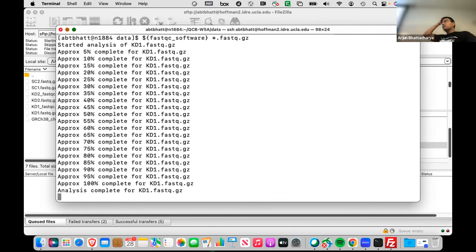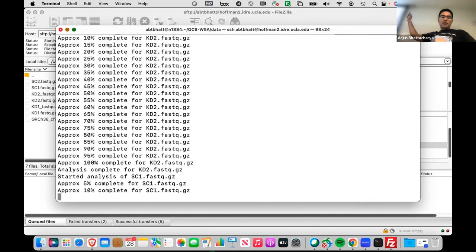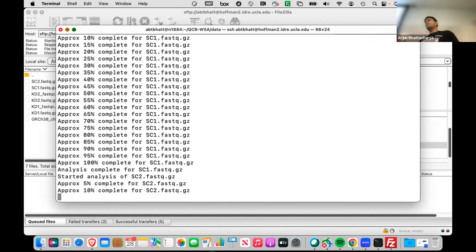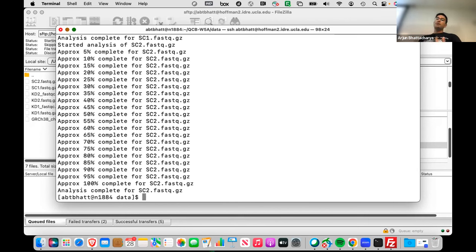In general, the way I think about quality control is that you have the metrics saved. You can't really do anything with the metrics right now. You can do a spot check at first: if you have hundreds of samples, look at five or six and see if there are any glaring issues. But then once you quantify and make PC plots and do your normalization and remove other kinds of variation, that's when you have this QC to go back to and see if there are any sequencing errors that need to be fixed. Is it that there are sequencing errors and lots of confounding from external sources, or is it just bad sequencing that you have to rerun?